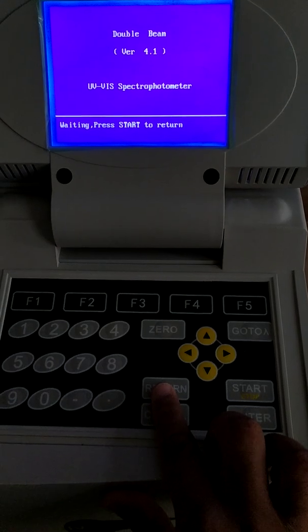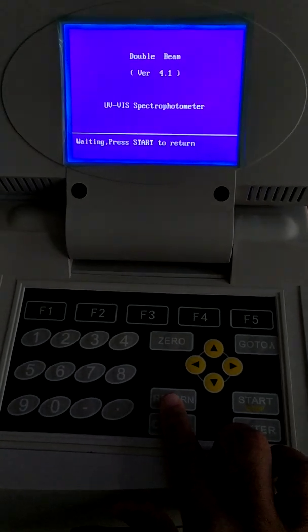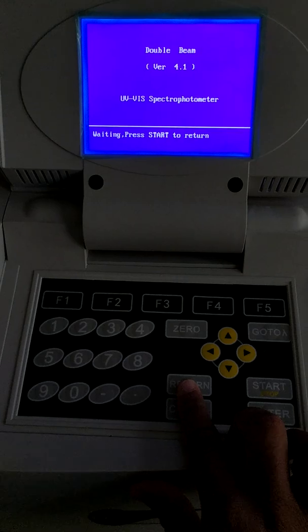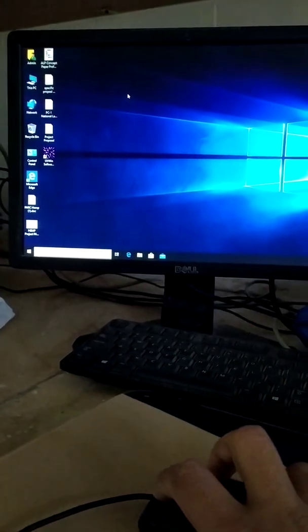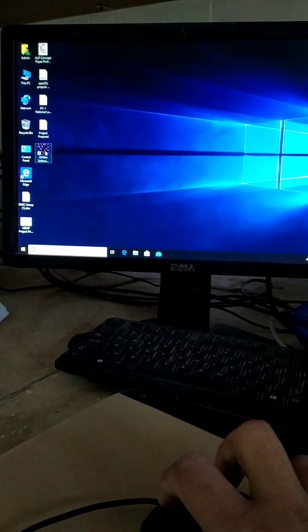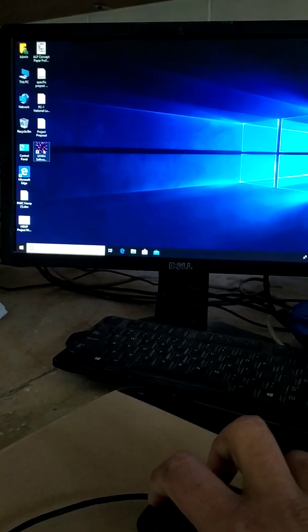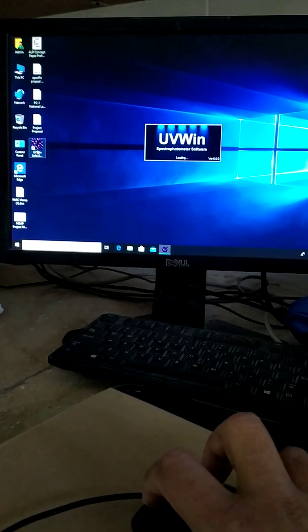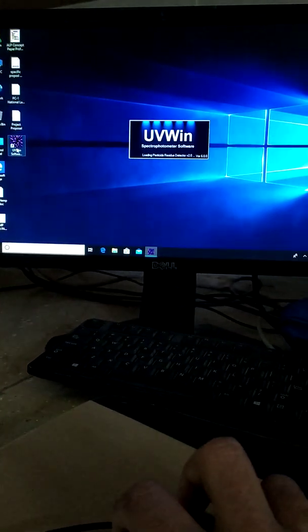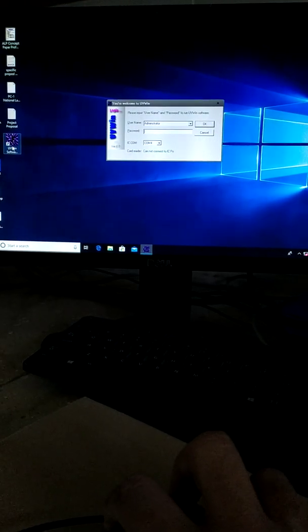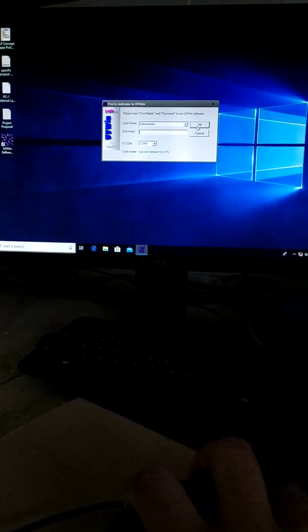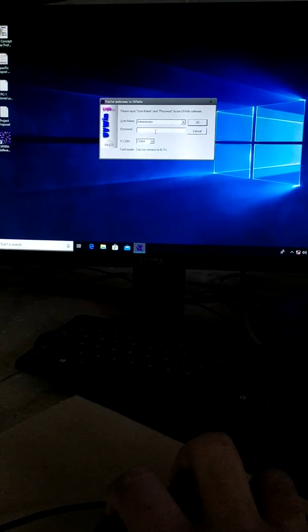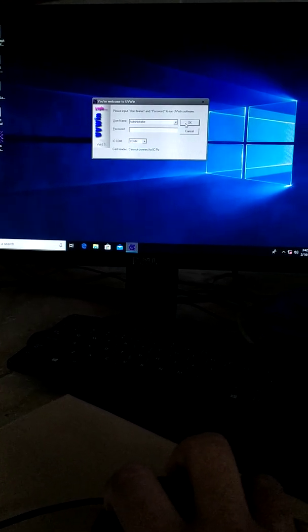Now move to the computer and double-click UV Wind software. The system will initialize. Press OK. You do not need to input any password, just press OK.